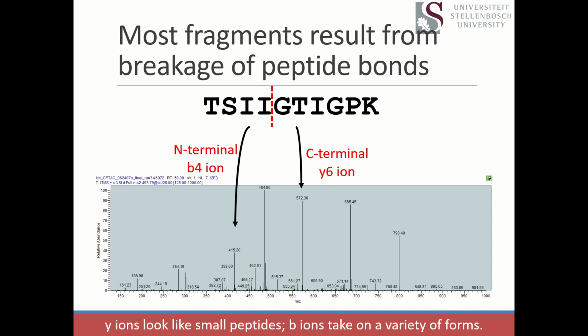Isoleucine, great. All right, and isoleucine has what mass? 113, did I hear? You didn't say 113. Well, that's okay. I'm going to tell you it's 113. And that's really important because it's a mass it shares with leucine. And leucine and isoleucine are ridiculously common amino acids, so 113 is a good one to know.